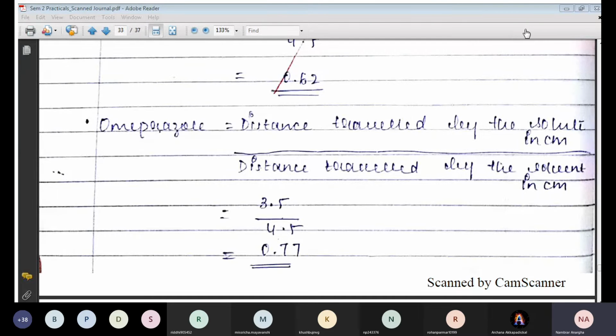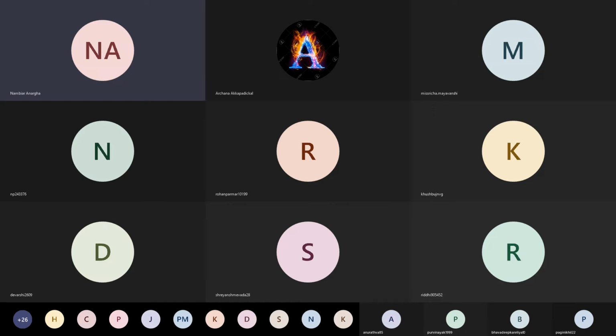So Archana, we may go to the next practical, that is separation of amino acids by TLC. We can. Should I open the journal? Yes.